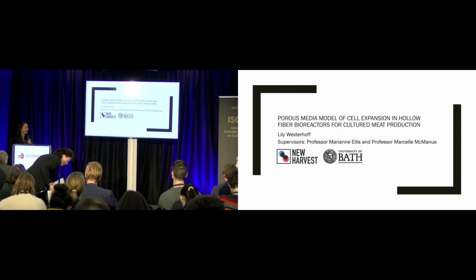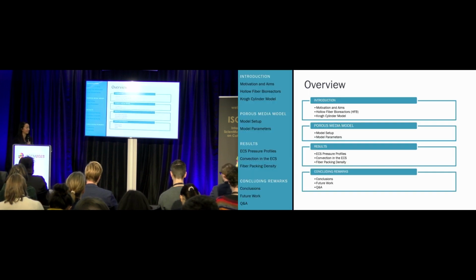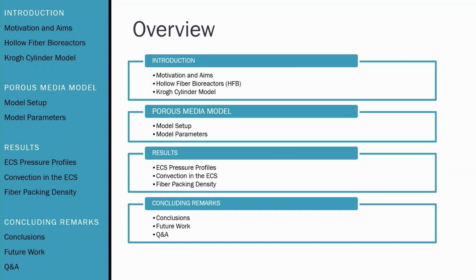Good morning, and thank you for the opportunity to talk about my work on porous media modeling of cell expansion in hollow fiber bioreactors. In my talk today, I'll begin with an introduction to the motivation and aims behind this work, some background on hollow fiber bioreactors. I'll discuss how the porous media model is set up, highlight some key results, and some concluding remarks, and leave time at the end for questions.